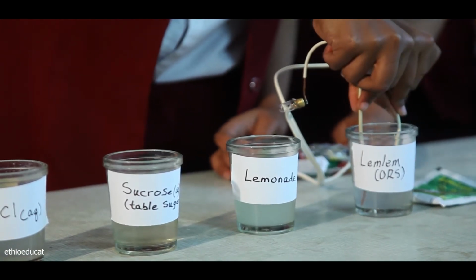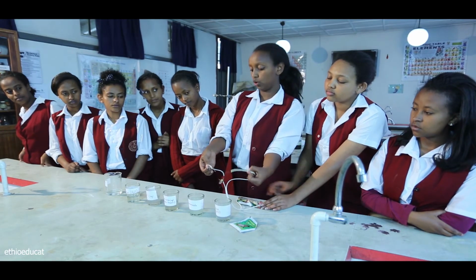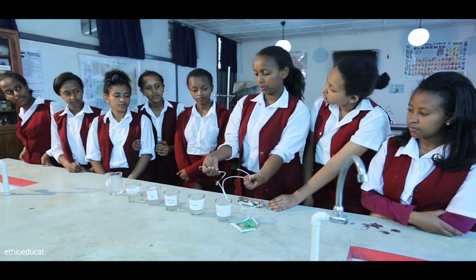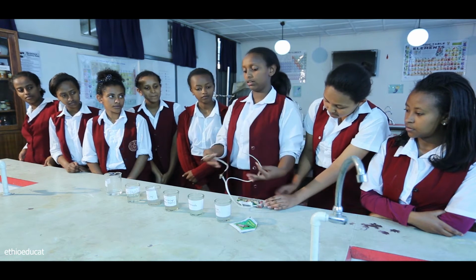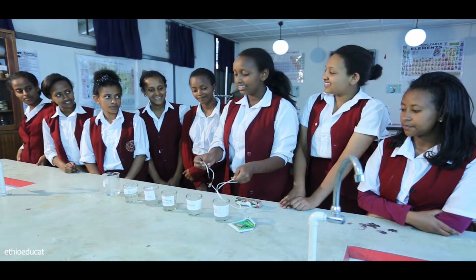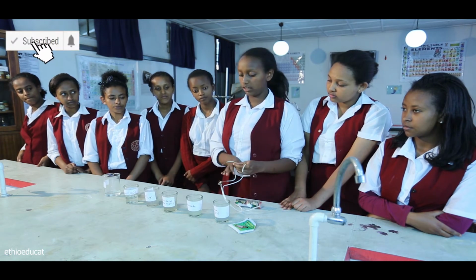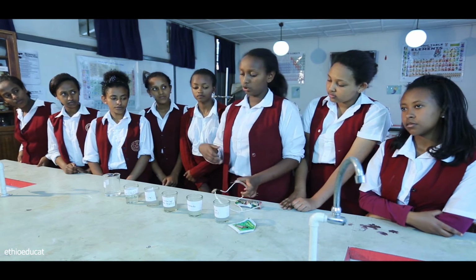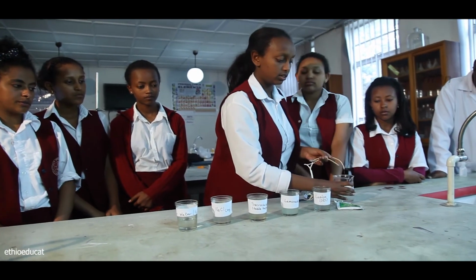Is it lighting? No. Okay. But would we expect it to light in this ORS? Yes. Why would we expect it to light? Because it's ionically bonded. How could you know that it was ionically bonded? I saw it from the ingredients. Yeah, it says that it contains salts. So we have seen here that sodium chloride is an ionically bonded compound. So it was supposed to be an electrolyte. Maybe it comes from the concentration. So let's concentrate it a bit more. And let's see if that makes a difference.